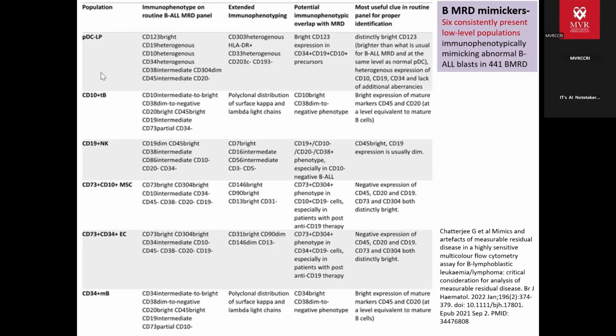So there are multiple tests, multiple groups which have proposed different recommendations for the events being acquired. The COG group did a study with a 6 color, 2 tube, where they said that 5 lakh events to 1 million is what is recommended. So for LOD of 0.01, if my limit of quantification is 50 events, I need 50 by 5 lakh, and I've reached a sensitivity of 0.01.